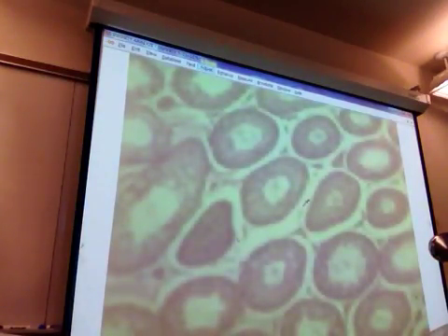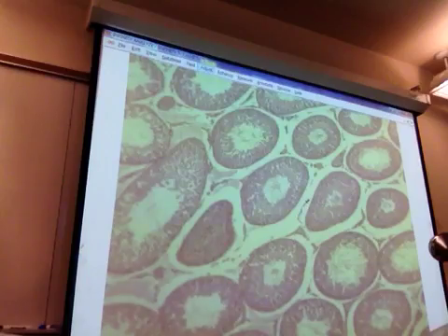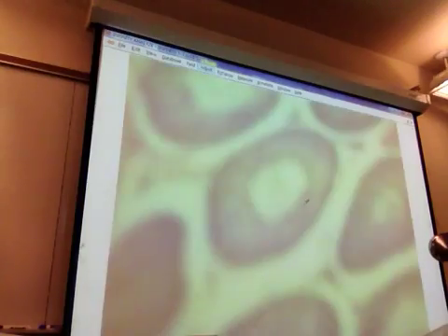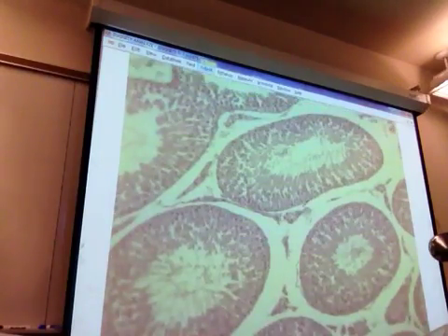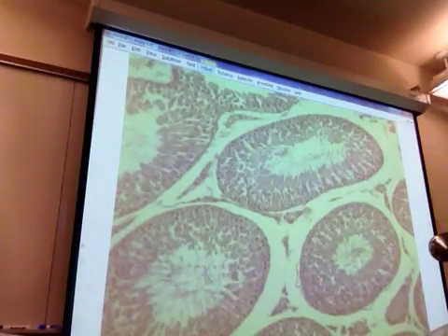Is there a way to specifically tell the difference between that? Because I'm going to go up to higher magnification. You'll be able to go, oh, there's sperm in that versus, oh, there's no sperm in that. Well, plus a good way is its epithelium in the epididymis, and that's definitely not, looks like that's not. Yeah. Exactly. Spermies.